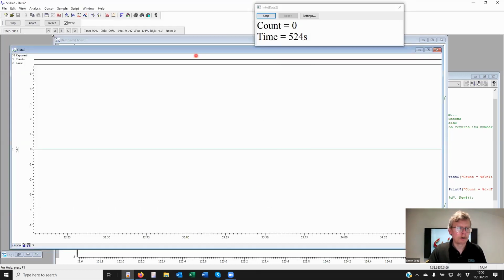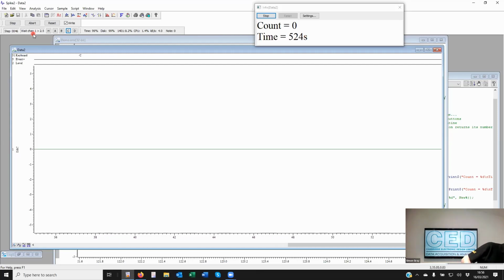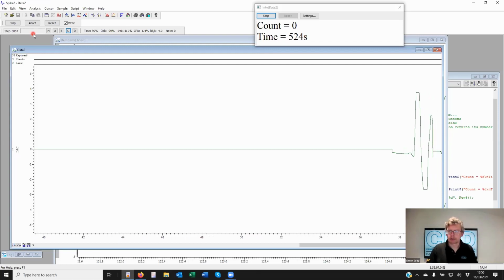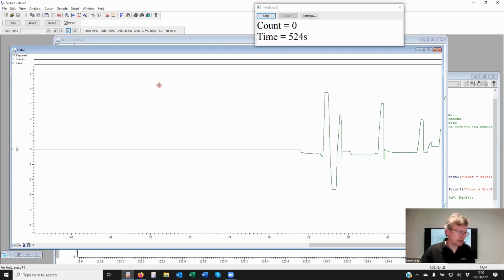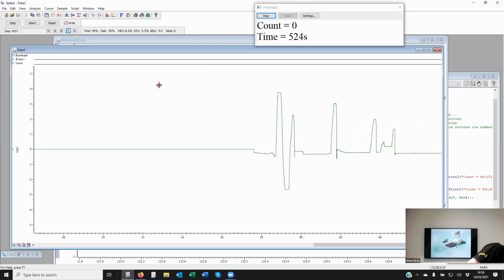Okay, so on C, I'll use this button this time. We're now in the detection mode. So here it's saying wait for channel 1 to be above 2.5 volts. I've got a simple waveform generator here on a joystick. There we go. Right, so that's managed to fire it.